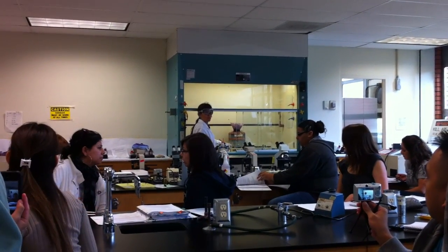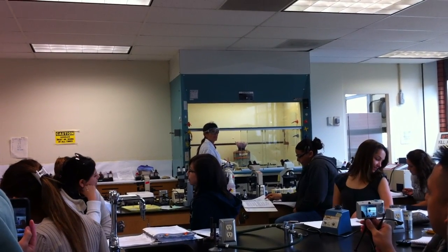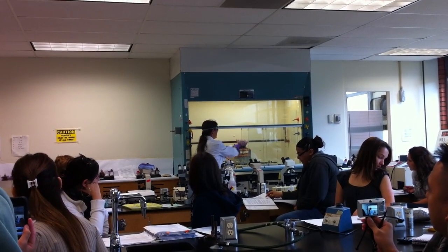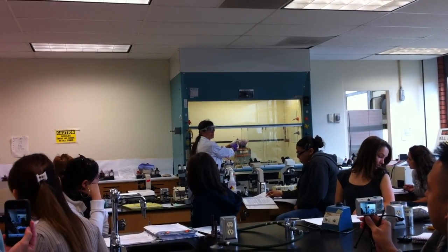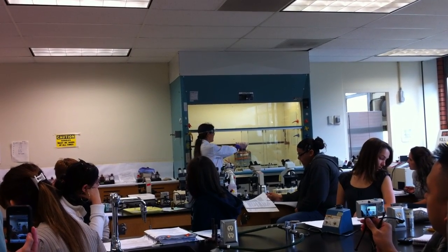Now what do I do, you guys? Do I read it now? Mix gently. Okay, I'm going to put the cap back on and hold it and gently mix it. Make sure the cap is on securely. You don't want it spilling all over yourself. Now what do we do?